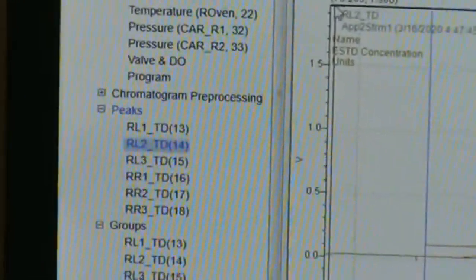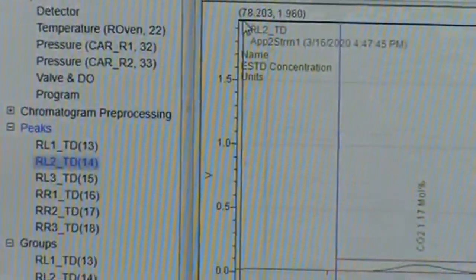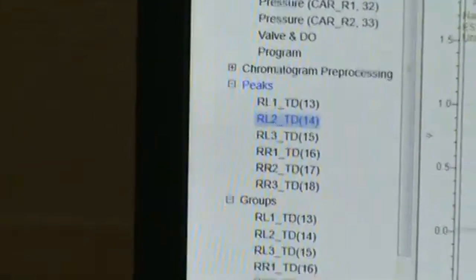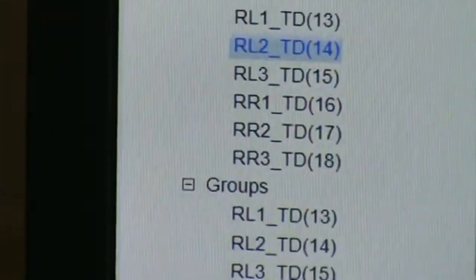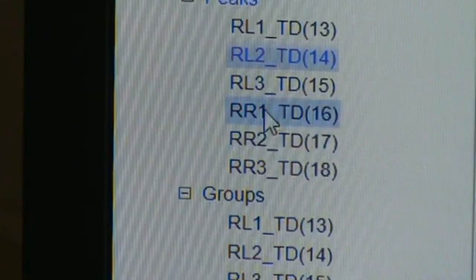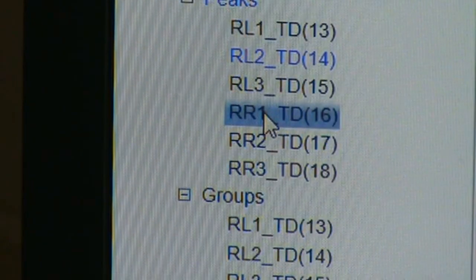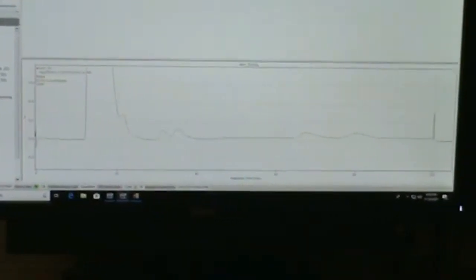We know we're back flushing everybody else. So now it's time to go take a look at our heavies. Right, 2. We know that we caught everybody and that we're back flushing our C6. We can look at it again. We'll go to right, 1. Pre-cut. Looks good. C4, C5s, back flush. Looks good.